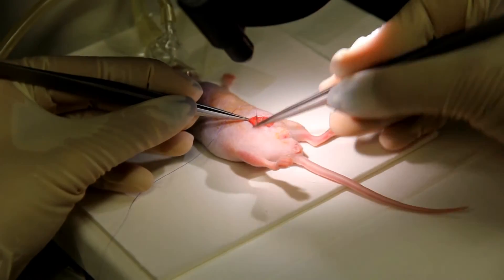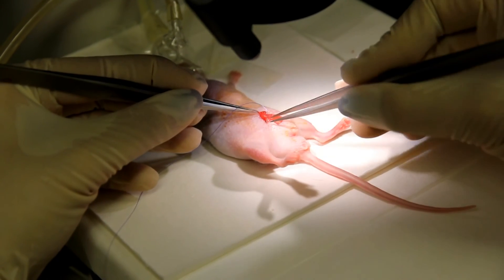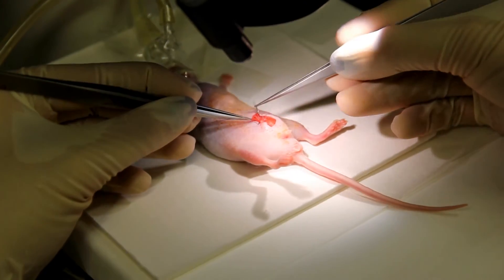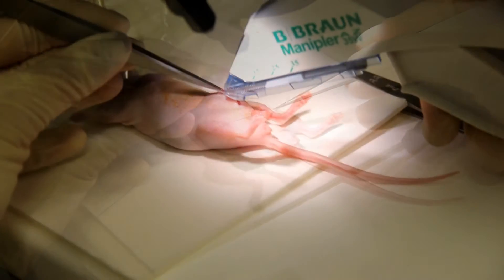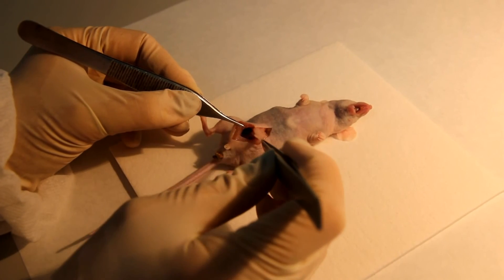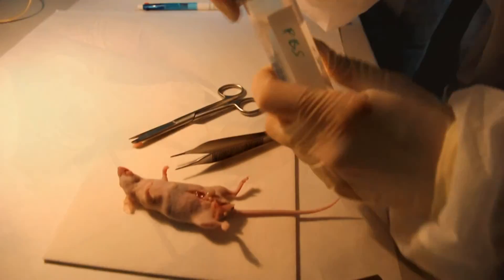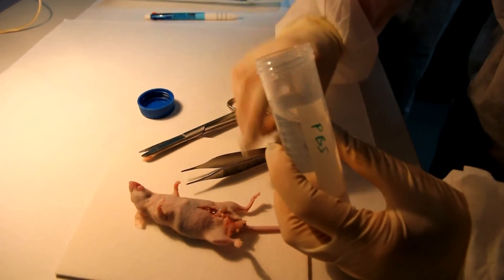To finish, suture the abdominal muscle with discontinuous suture and the skin with staples. Return the animals to their cages and place them on thermal plates at 37 degrees. Testes of recipient animals are analyzed approximately eight weeks after transplantation for colonies of donor spermatogenesis. For that, we sacrifice recipient mice by CO2 inhalation followed by cervical dislocation and proceed with orchiectomy.